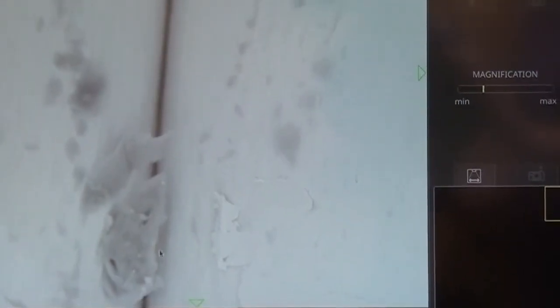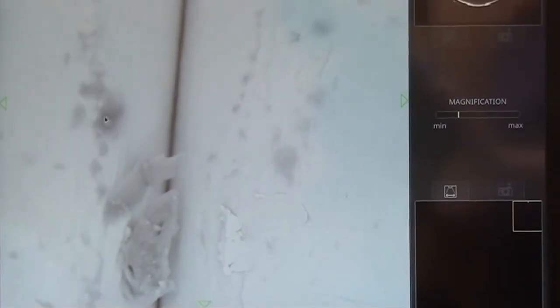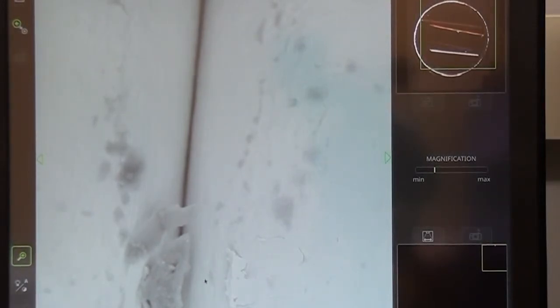It also looks a little powdery and it's dark compared to the brighter structure here. If you remember, the SEM imaging from phenome is basically using the backscattered electrons, and backscattered electrons are dependent upon the atomic size. So higher the Z, brighter it is.